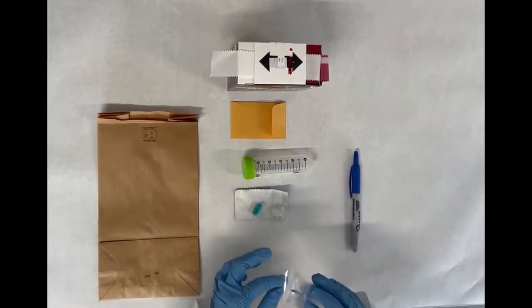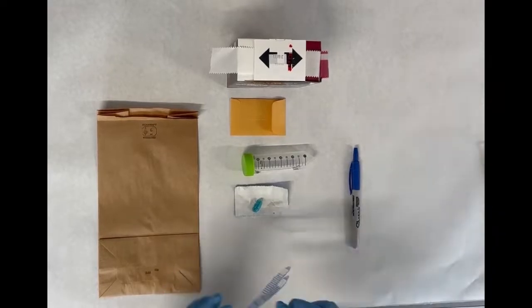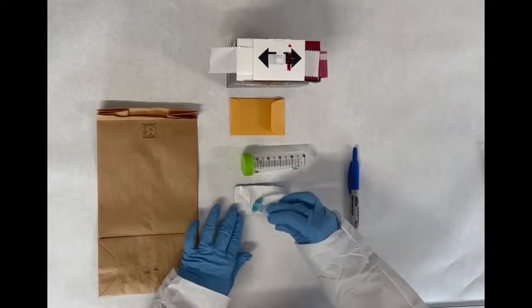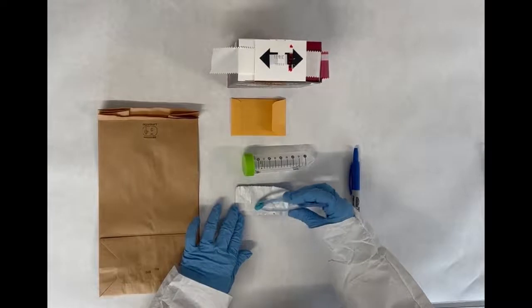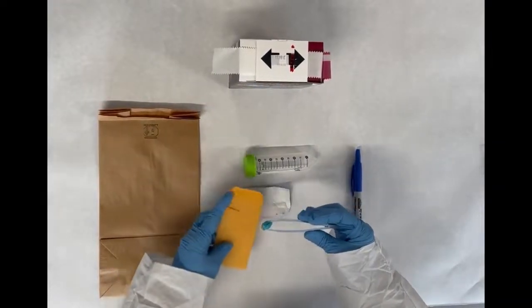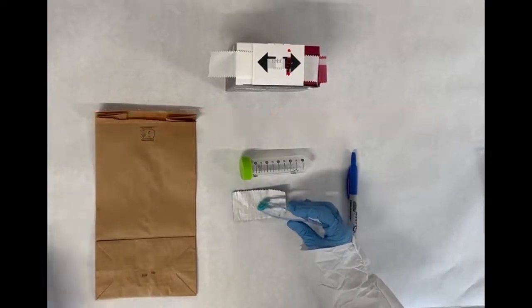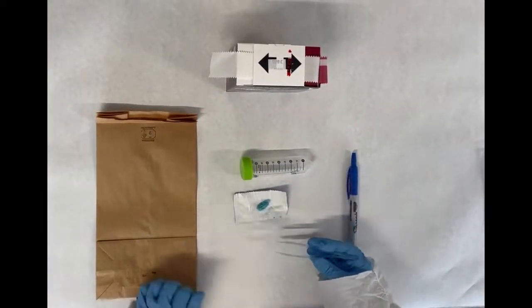First, determine if the gum is completely dry and hardened or if it is still pliable. If the gum is hard and no longer sticky, carefully pick it up using clean gloves or sterile tweezers and place it directly into a small envelope. Seal this envelope with evidence tape and place your initials and the date across the seal.